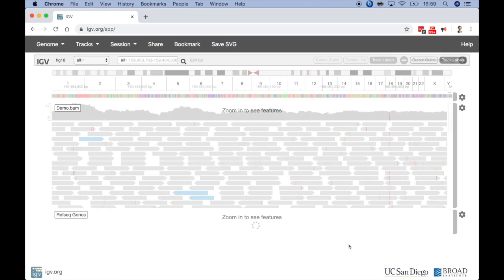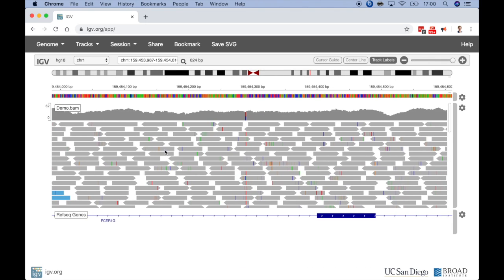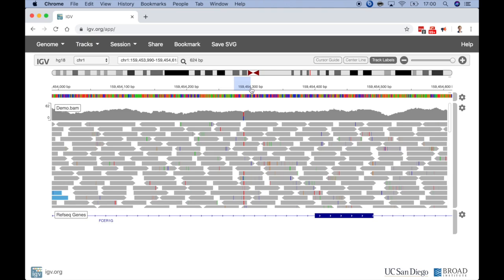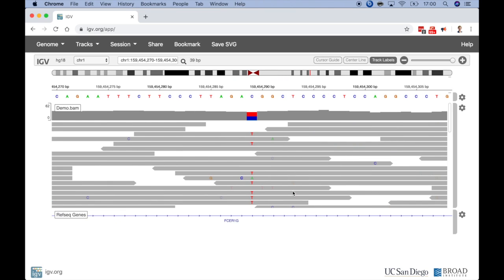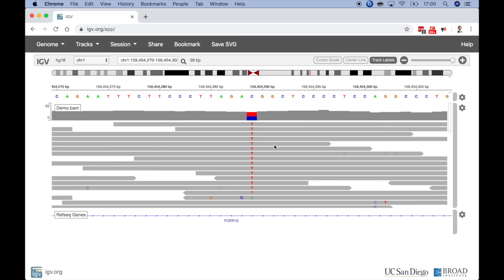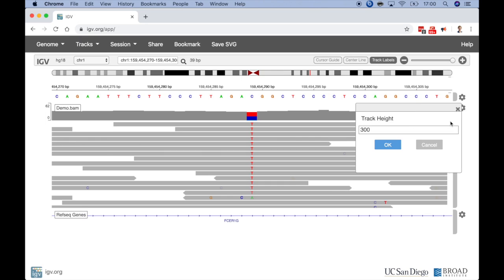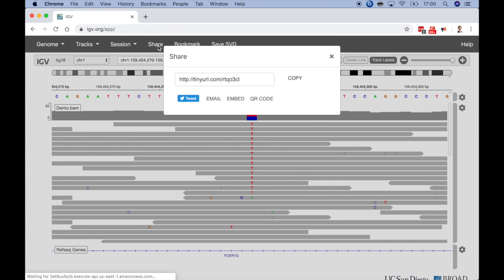Now let's zoom in to get a look at the data. This looks like a SNP here. Let's right-click and sort by base. I think this is an interesting SNP that my colleagues will want to see. To share this view with them, all I need to do is go to the Share menu.